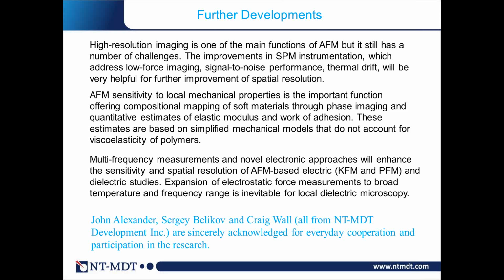Okay, that's okay. The imaging of the cells by itself, imaging of the cells in the liquid, and then bringing the electric measurements to the liquid, they are all three different and very complicated problems. One thing, of course, everybody wants, and this is the privilege of AFM, is to be able to do studies in a broad range of environments. However, liquid is the environment where making AFM work in the way we want is rather difficult.